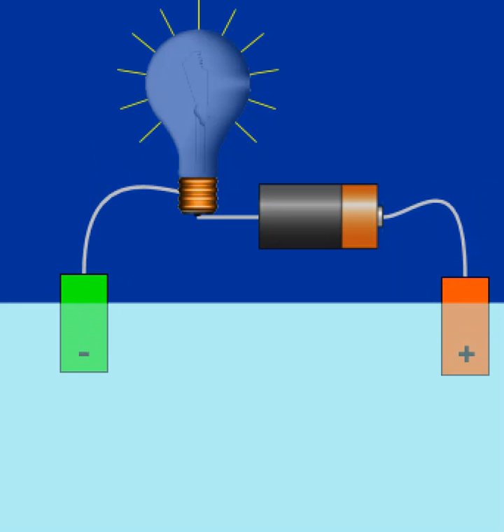And we can see it lights up, but this is like a medium light because with fewer ions, there's less to conduct a current. Ions are the key. The more that you have, the more it will conduct.